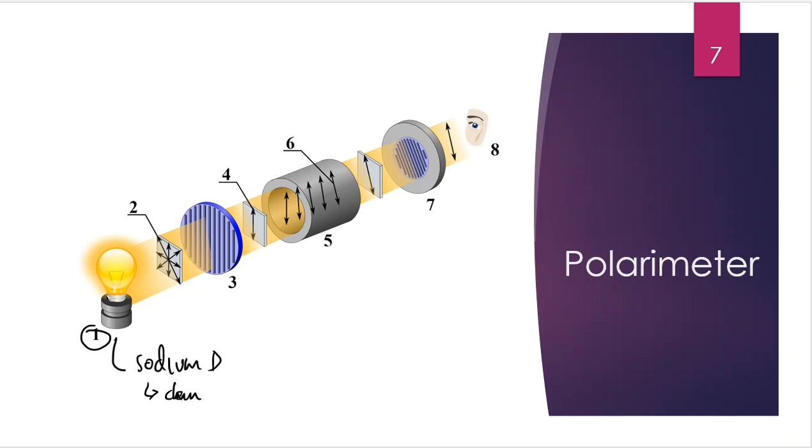We'll talk about this at a different time, especially in our spectroscopy course. But sodium provides mainly one wavelength that we can pick out, and that one wavelength eliminates all the other multiple choices of wavelengths that come along with regular light bulbs. So this was a very clean light bulb, and it made our job a little bit easier in something like a polarimeter, because we're only looking at one wavelength now. That's great news, because we don't need to add any extra filters, extra digits, or extra settings. So very cheap, very clean, and it makes sense.